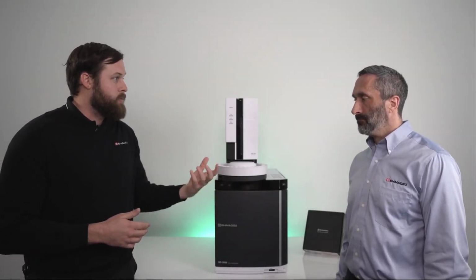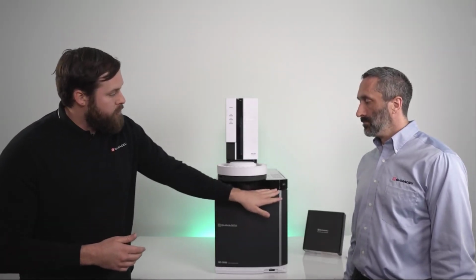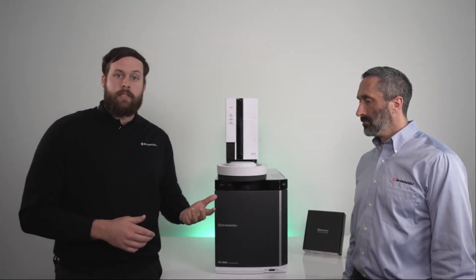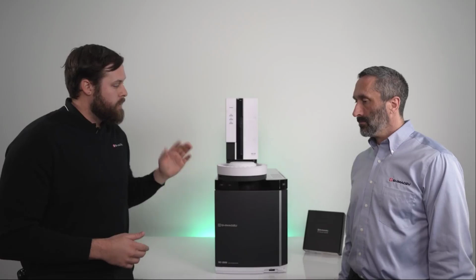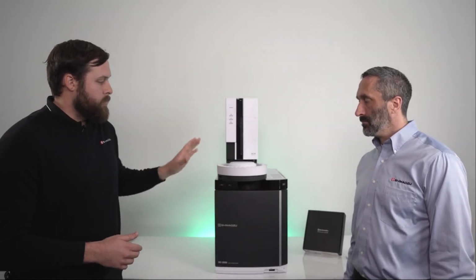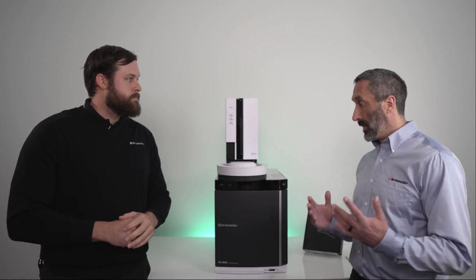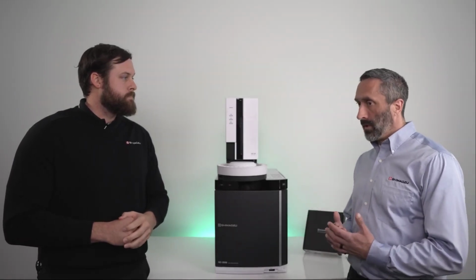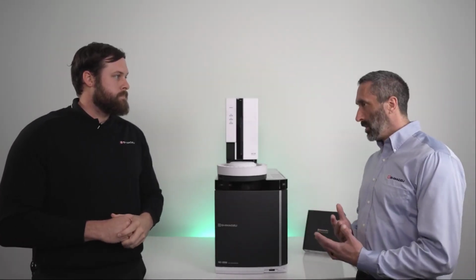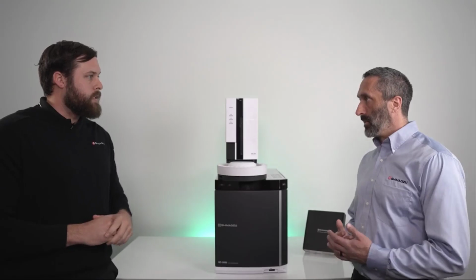It'll cool down the injection port, it'll turn off the flows. These lights will actually change colors to let you know when it's time to perform maintenance. You can perform your inlet maintenance, press the maintenance button once more, and all of the consumables, the gas, everything will reset and go right back to where it was before you started. It sounds like it adds a lot of simplicity and reduces the training costs for new analysts in a lab, and adds a lot of benefit.